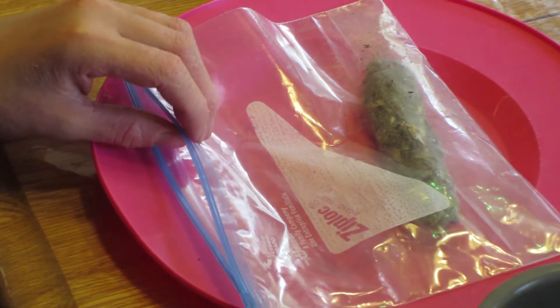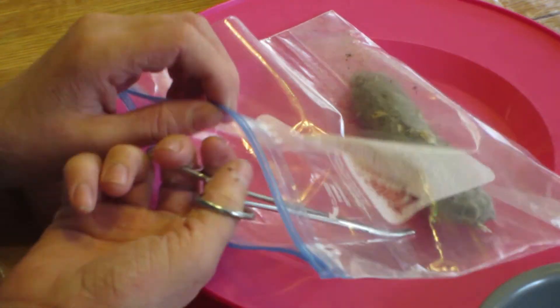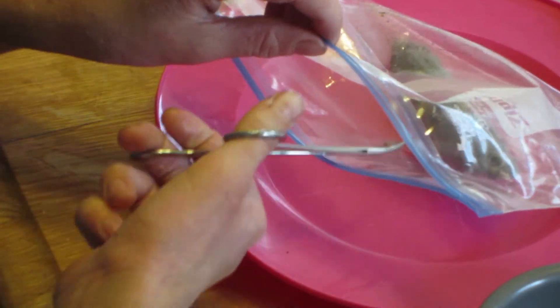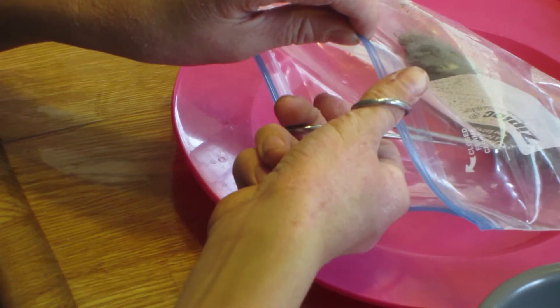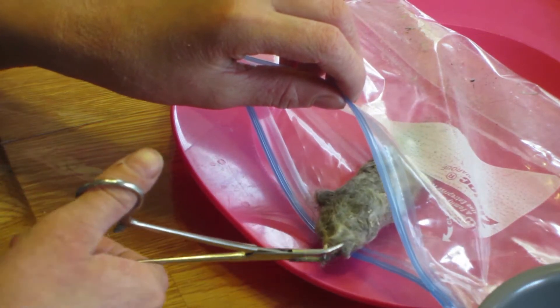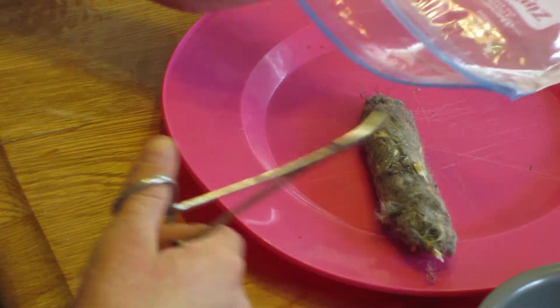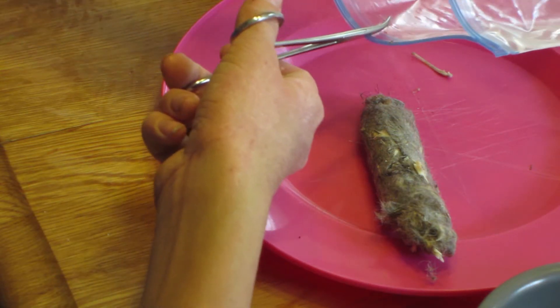This owl pellet mostly consists of hair and bones. The owl eats the animal whole, and then later it spits out the bones and fur because it can't digest them properly. We've got all the bones out of there.